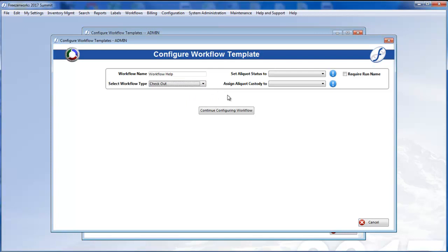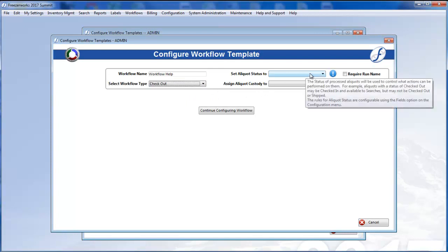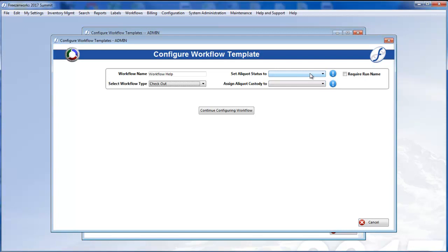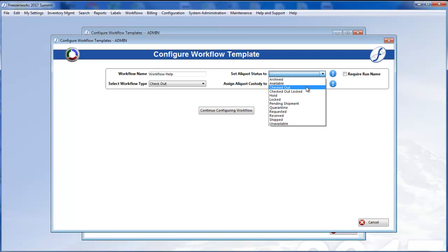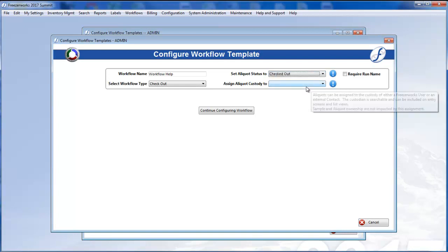The Set Aliquot Status drop-down determines the new aliquot status of each aliquot that you process this workflow on. For more info about aliquot status, see part one of this series. Now we'll just select Checked Out since this is a check-out workflow.